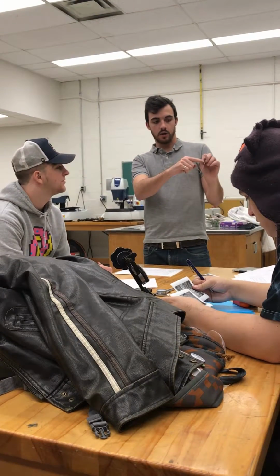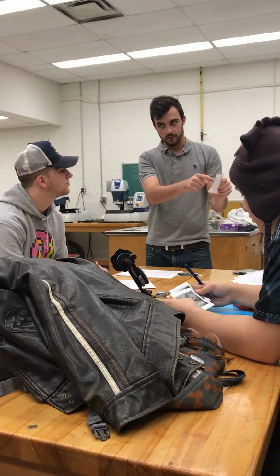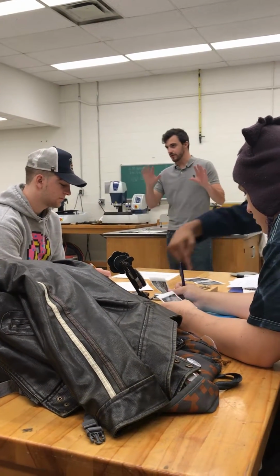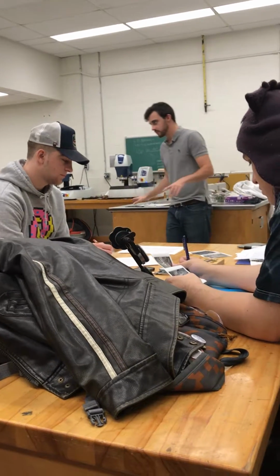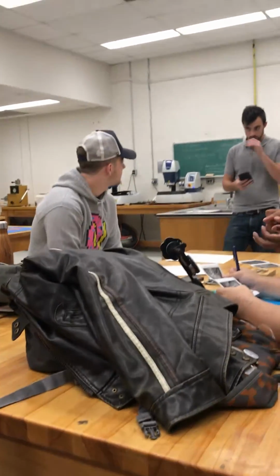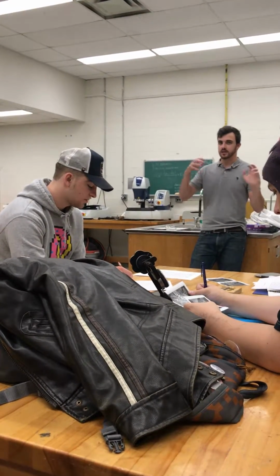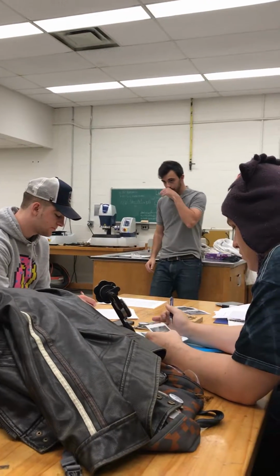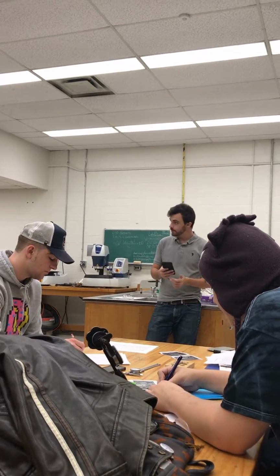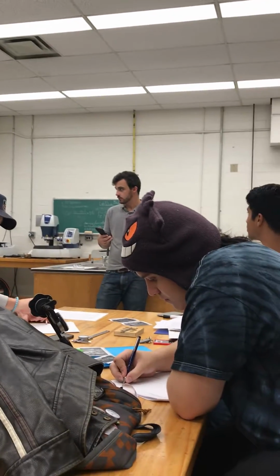And then I need you to outline a grain, and outline a grain. Everybody's clear on that? Everybody's going to get 100% on their micrographs. Equiaxed just means approximately the same size on all sides. Your direction, you just did this, right? So I want you to just draw arrows.